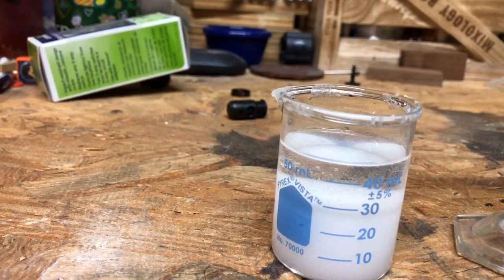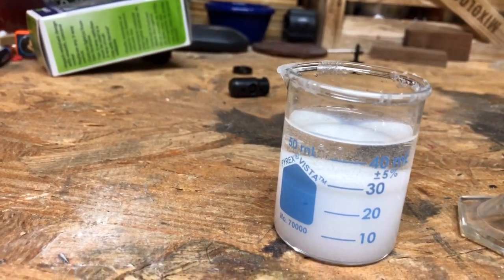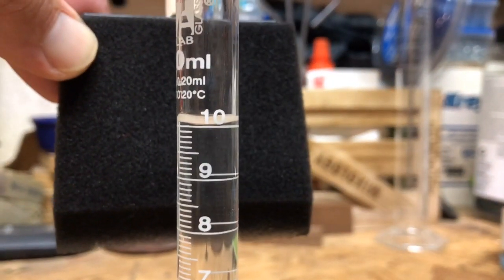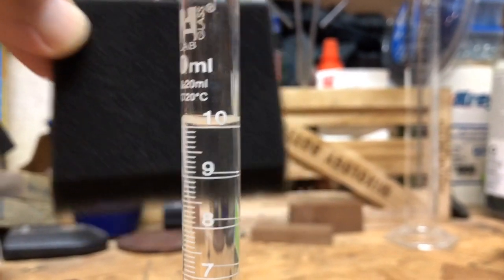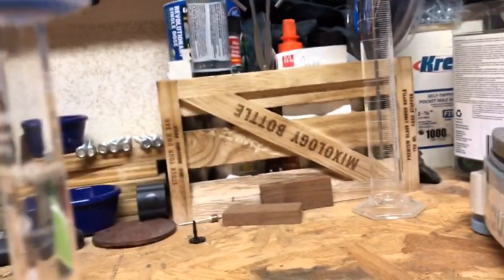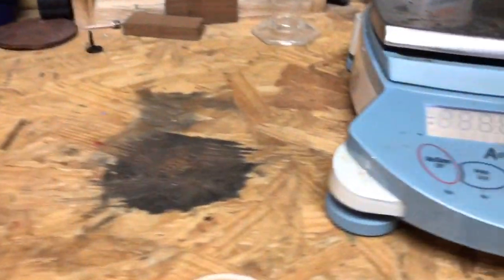All right. Let's see where we're at now. So we'll come over here and try to get our measurement on this. What would my measurement be for my volume? And we are going to take a couple of masses now.